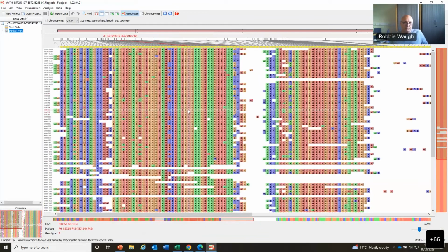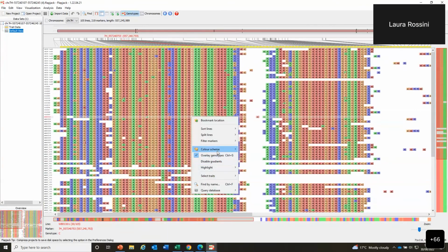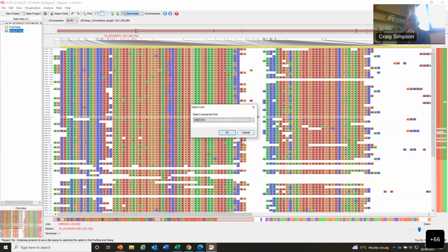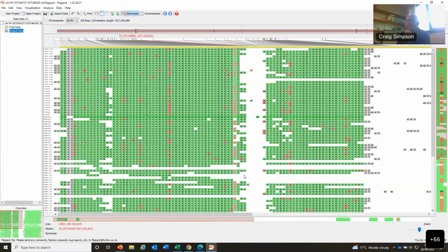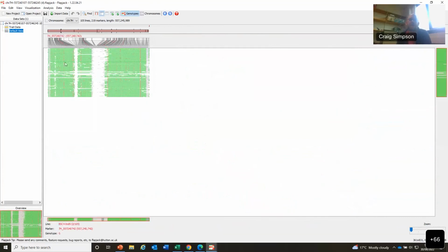So this actually relates also to the question from Udza. She's also asking, or he's also asking, I don't know, is there any way to identify SNPs using this database? So it's kind of connected. I can show you now. So if you go to the color scheme, change that to that. So basically you then identify these different variants. My picture's in the way, so if I zoom all the way out, you can see quite clearly there's some really nice potential SNPs that you could pick out if you wanted to. I'm going to go back.